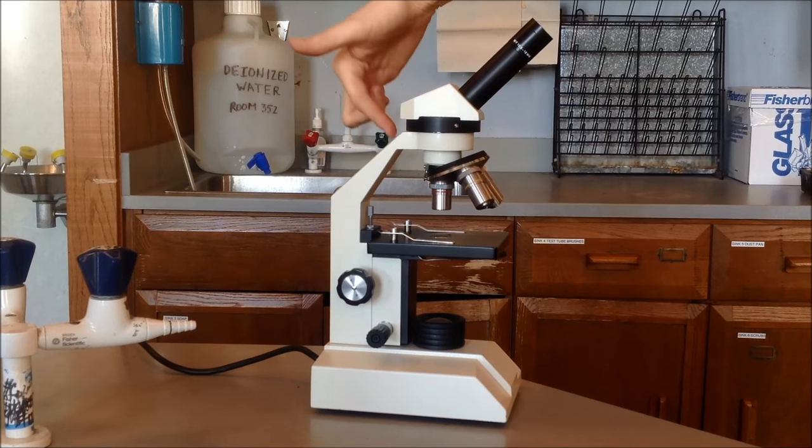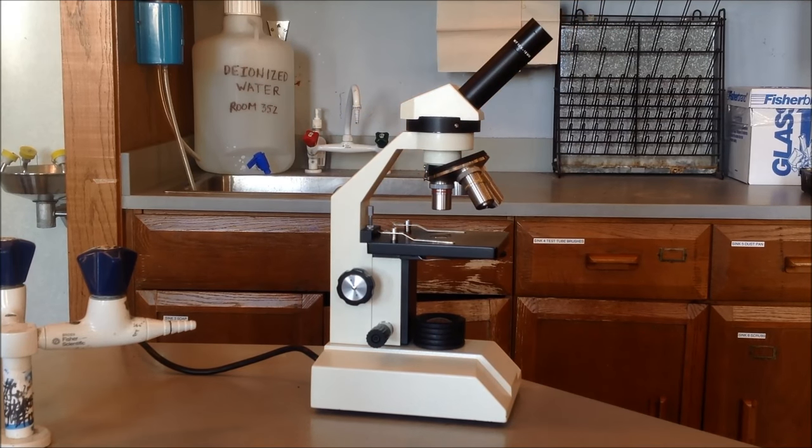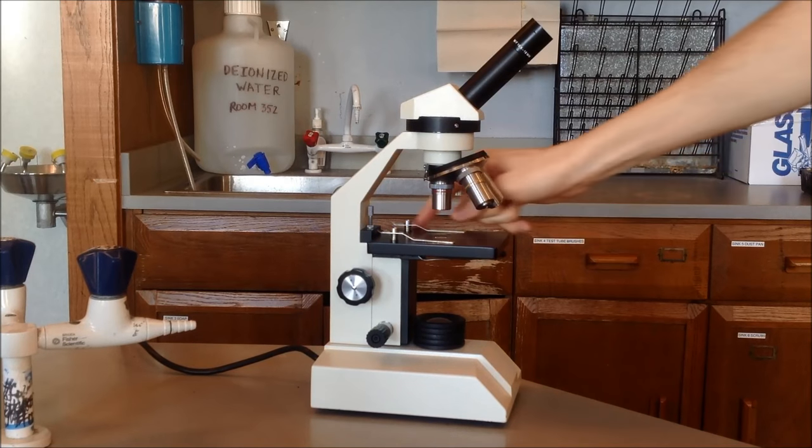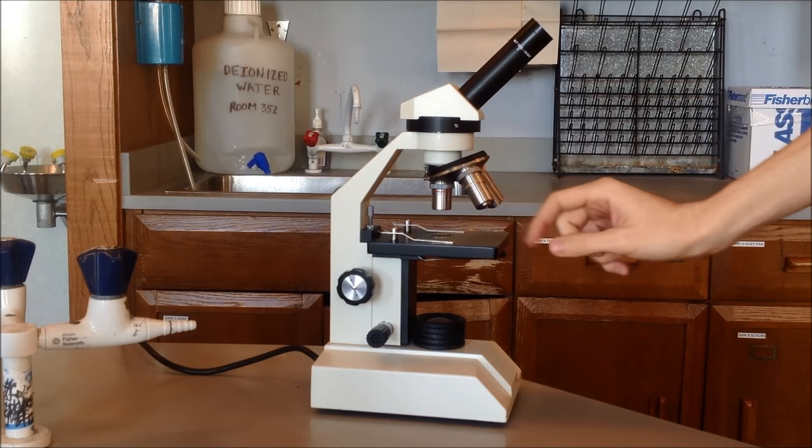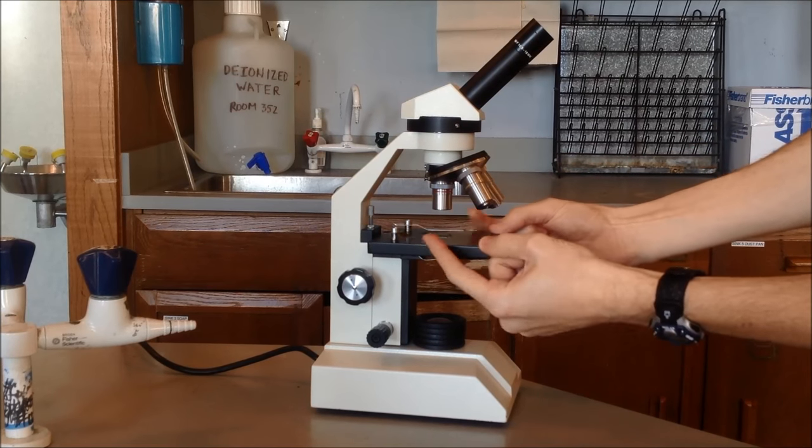The arm is this part right here, which we mentioned before. And then you have the stage with the stage clips. The stage is this thing right here. It's this big black square. And then the stage clips are on the stage. These are these metal things right here, like so.